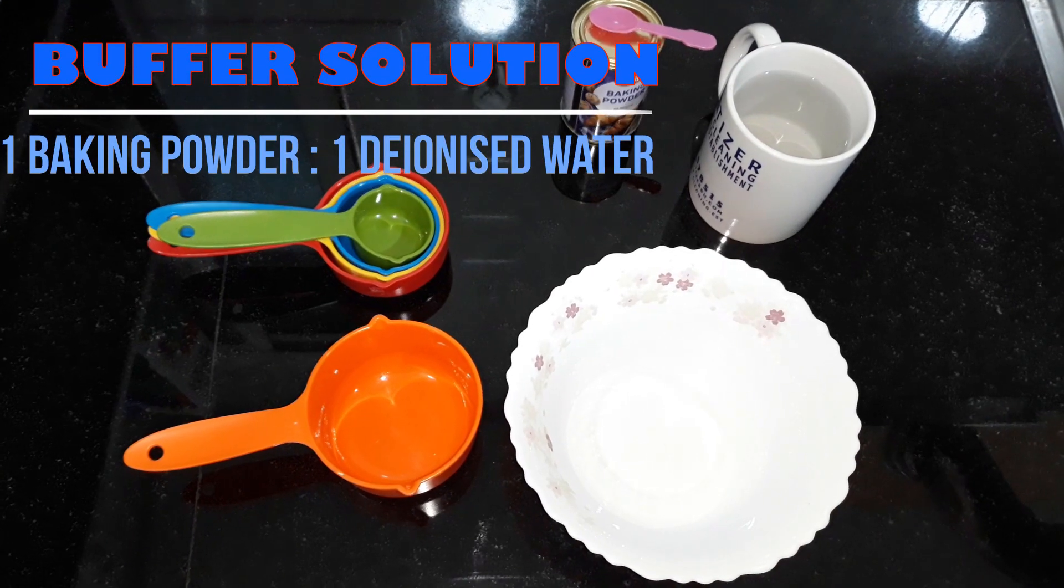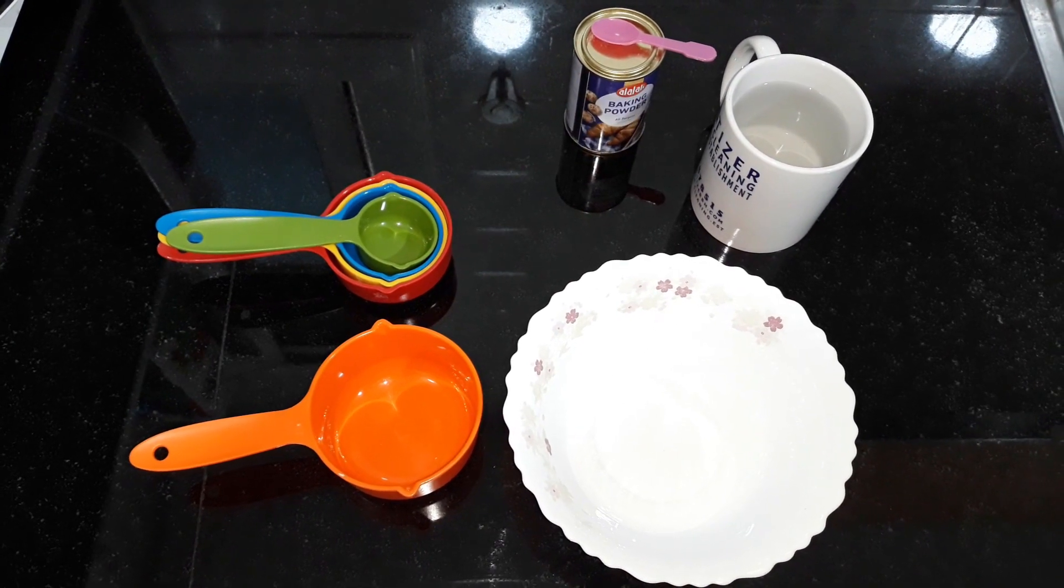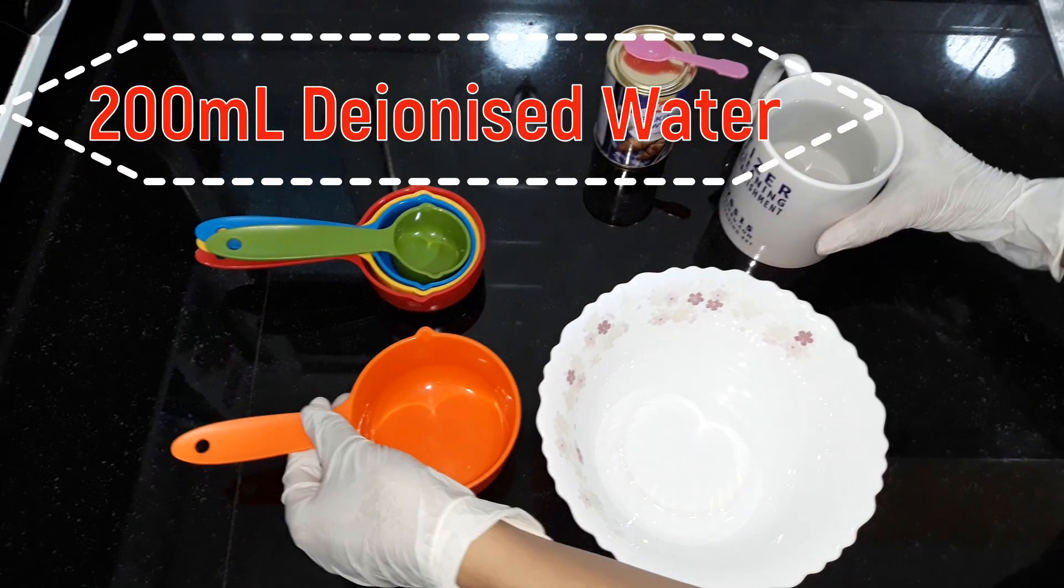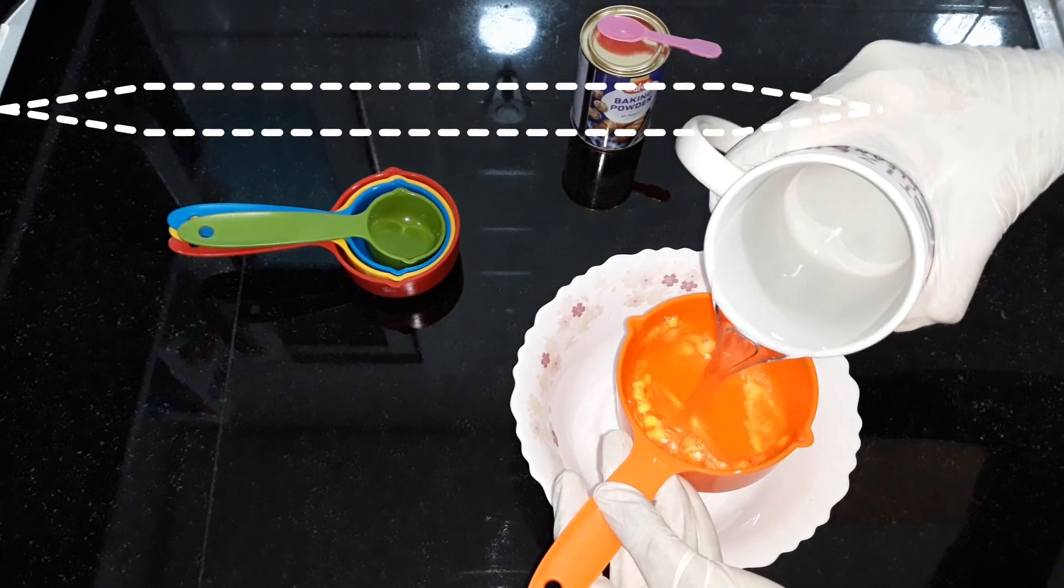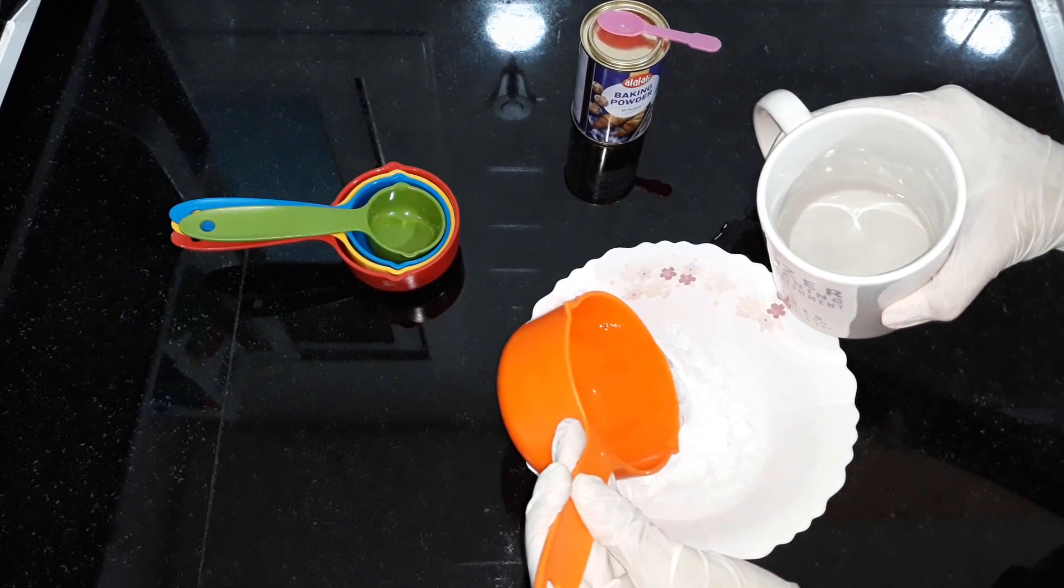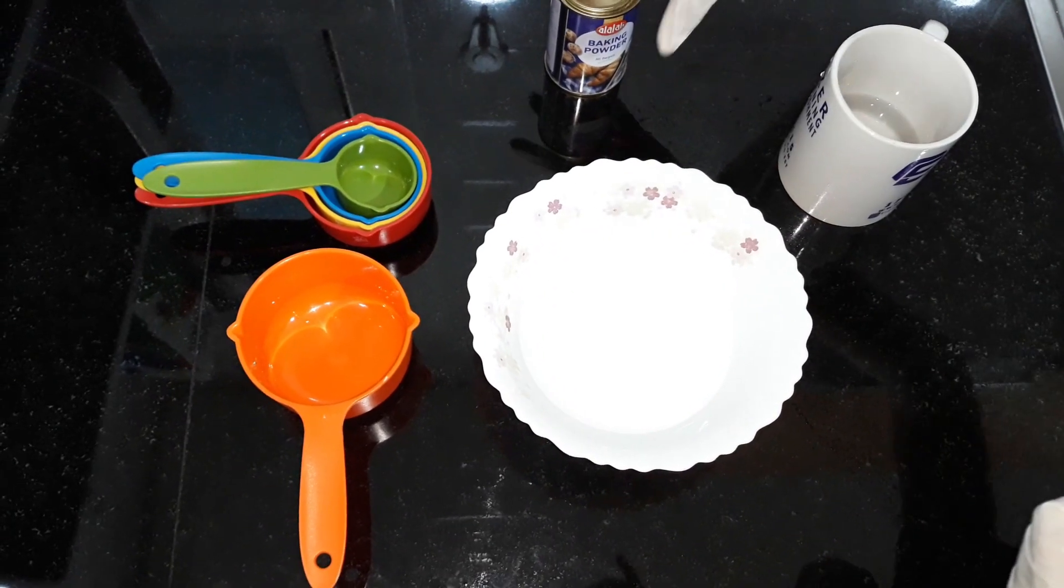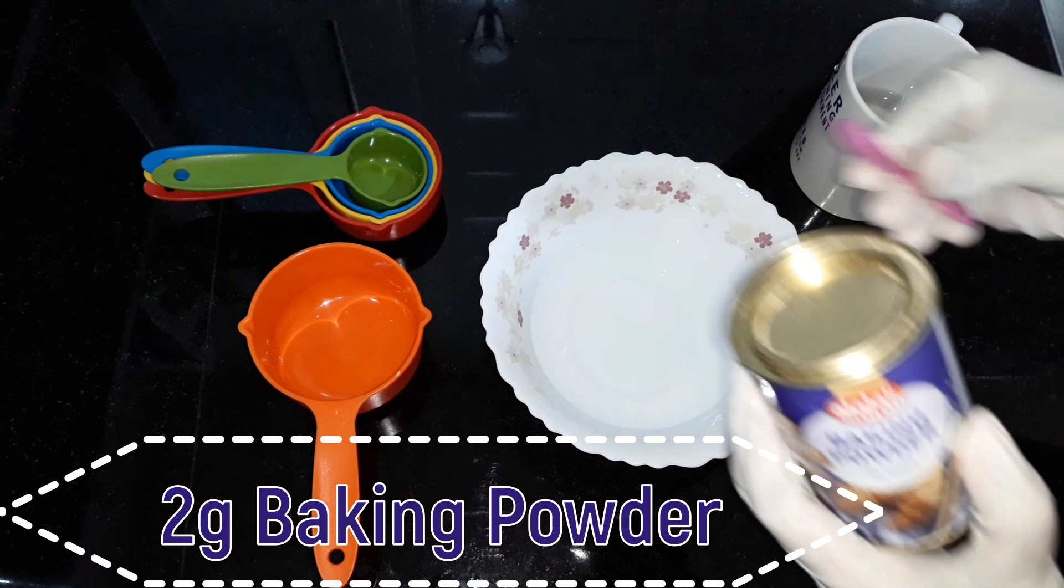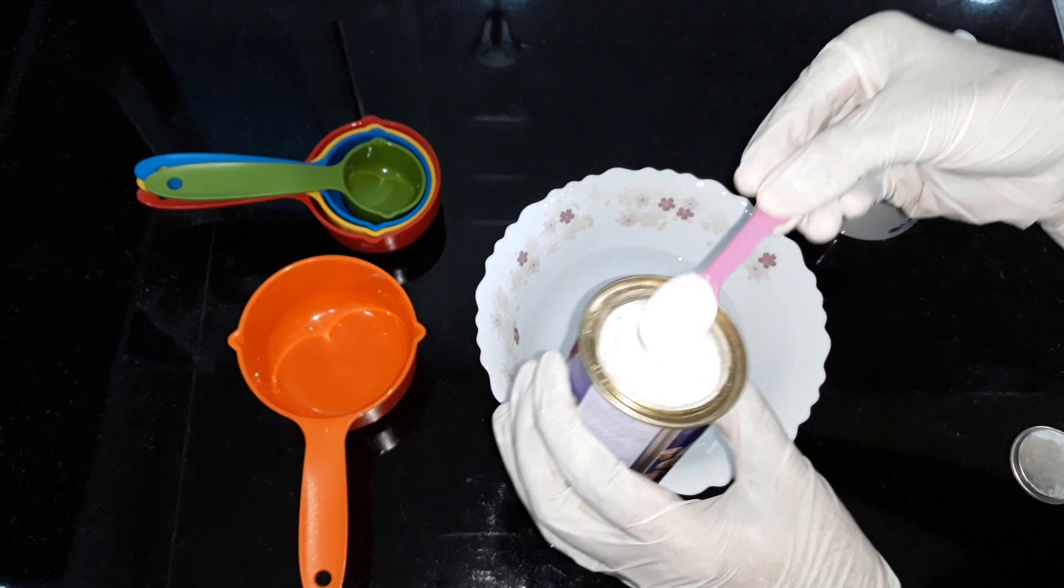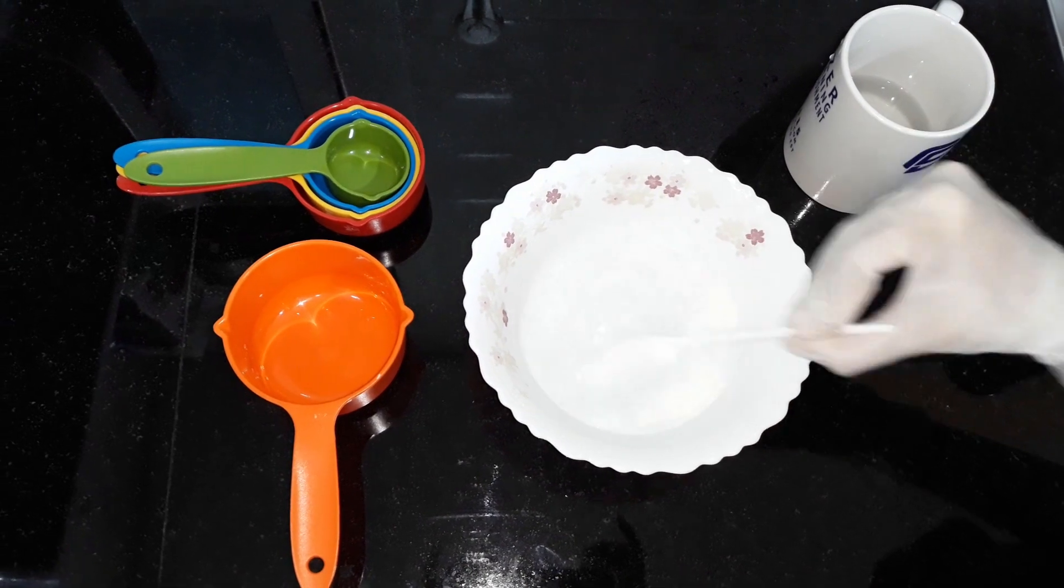First, we are going to prepare our buffer solution which consists of baking powder and deionized water in the ratio 1 is to 1. Following the ratio, we add 200 ml of deionized water into our mixing bowl. Next, we add 2 grams of baking powder, approximately half a teaspoon. We have to mix this solution well.